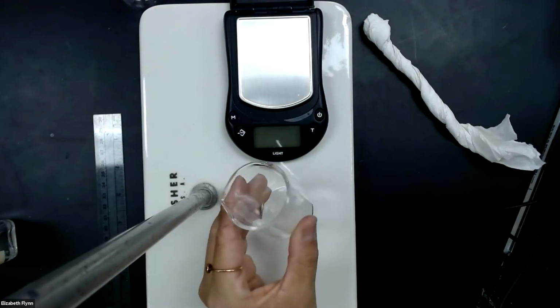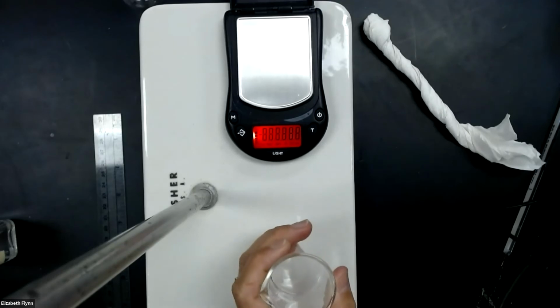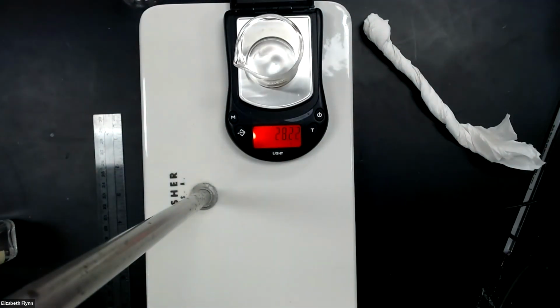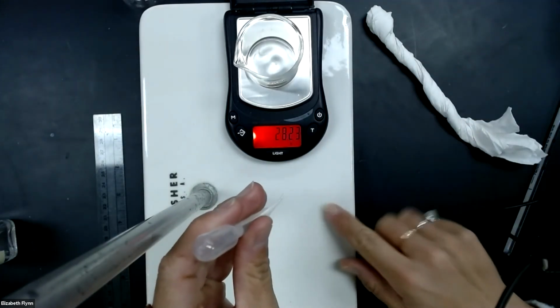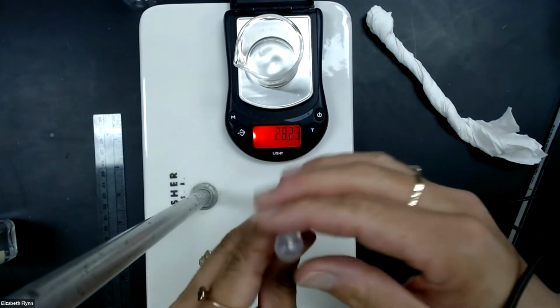Okay. So we're going to get the mass of the empty container. And again, I just recommend you use your beaker here. Make sure that you clean it and dry it. And so the mass of my empty container, this beaker, is 28.23 grams. And now I've got my pipette, right, with some water that I have drawn into the pipette. And I'm just going to practice making drops of the same size on this enamel metal surface. You can use a plate or something.